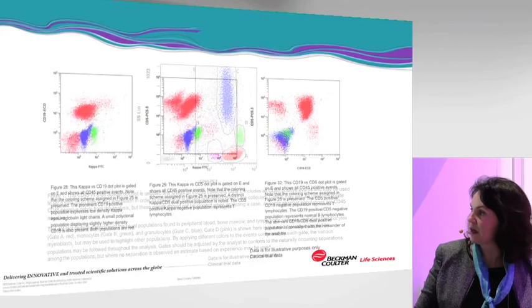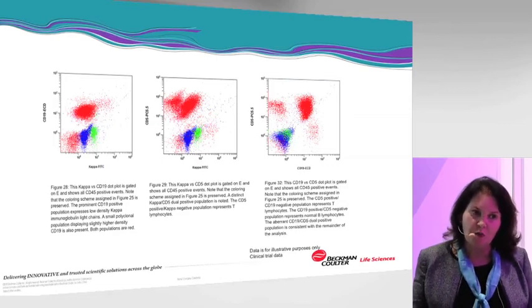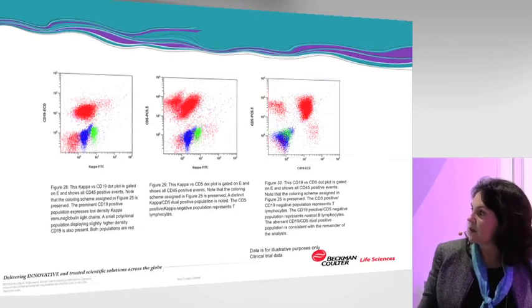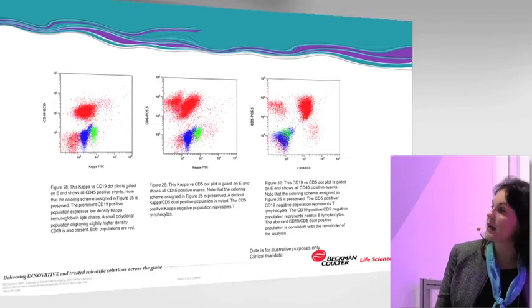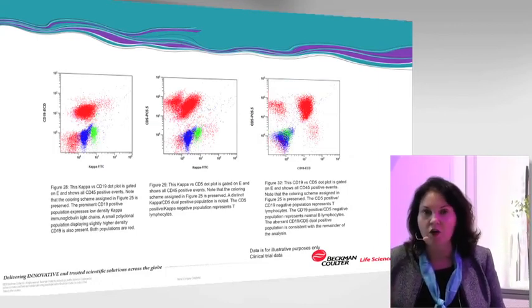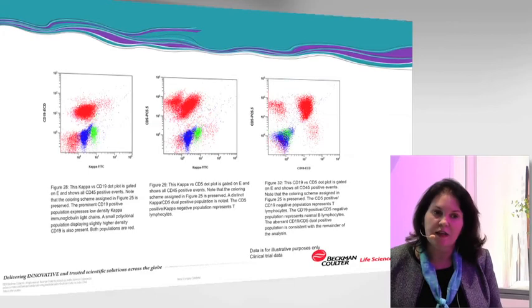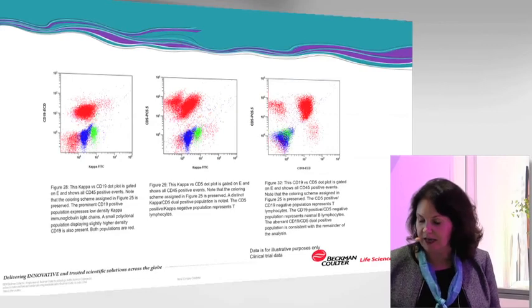As you see as I go through, I have additional information here. I include things like what's the characteristic staining pattern, what are the normal events. Over here I specifically point out, at the bottom of this paragraph, it says gate E may also be used to exclude CD45 negative debris from the analysis, but these events should not be ignored when analyzing a case, as some aberrant populations are CD45 negative. These are the important caveats that you come to know when you're proficient at doing this, and we want to specifically note that in the casebook. And these are some more of those excruciatingly annotated dot plots that are there for every case in the casebook.